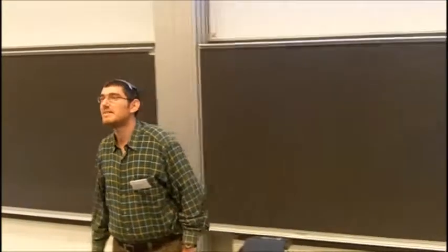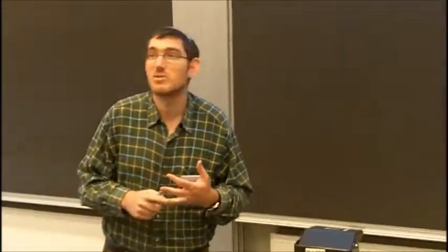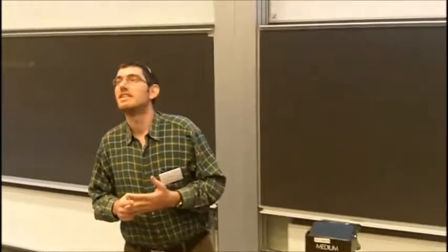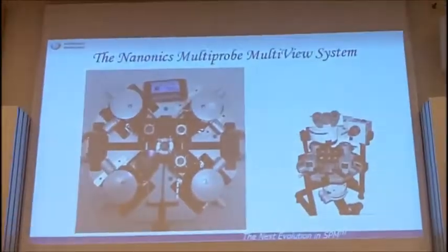Okay, so today we're going to talk about integrating the SPM with other machines, other probes, because just scanning AFM, just scanning NSOM, today it's not enough. We want to have also electrical measurements, magnetic measurements, and we want to know chemical properties, for example, using Raman. So today we want everything to work with as many data as possible at the same time, make us a cup of coffee, publish our article at the same time, and just finish whatever we have to do. So this is what we call a multi-probe system.